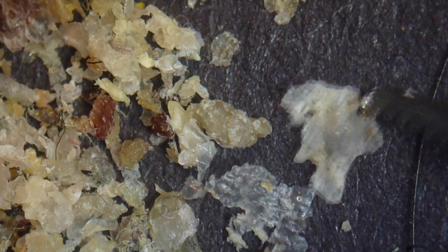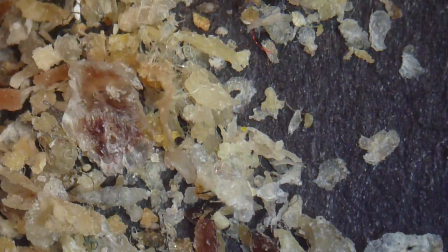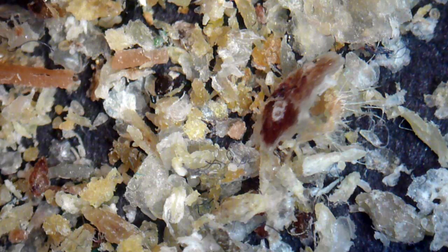The hair looks almost a little bit like a wire at this magnification. What I did not find, however, are dust mites. I have to admit I was a little bit disappointed because I was actually hoping to also find some of these little critters, since dust mites actually eat the skin as a food source. Unfortunately, I was not able to find any of them. Here is another picture — a still image — yet another one, and you can see also that there is a slight coloration. I guess this depends a little bit on the amount of oil or grease that was in the dandruff.